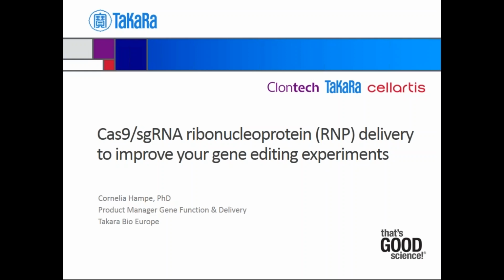Thanks for joining today's webinar, in which I would like to focus on the benefits of Cas9 guide RNA RNP delivery for gene editing experiments.